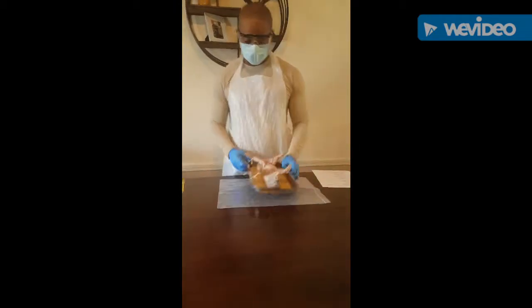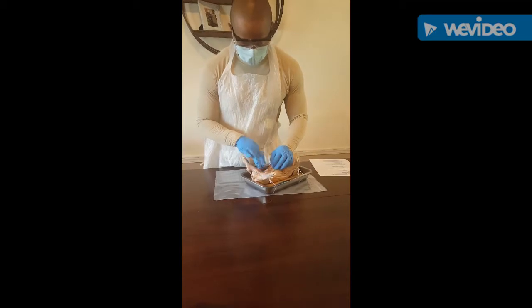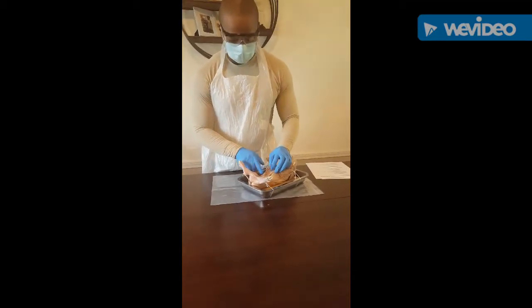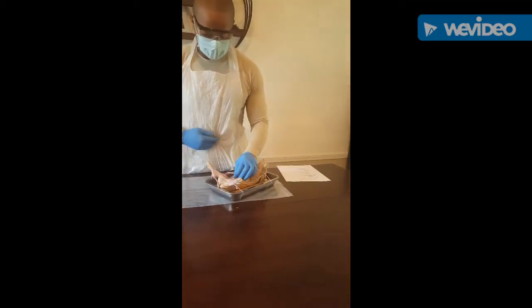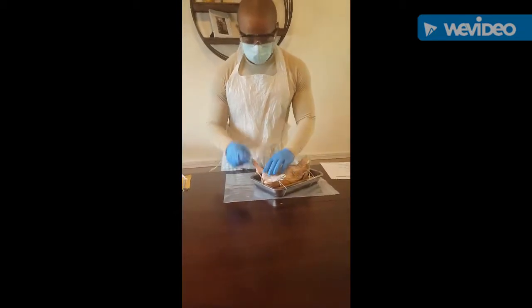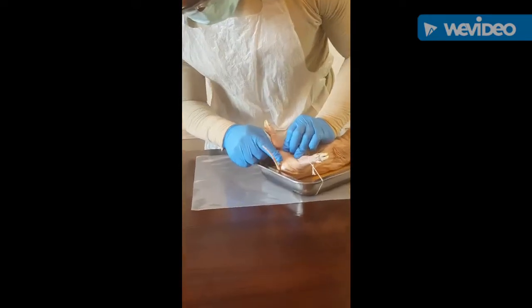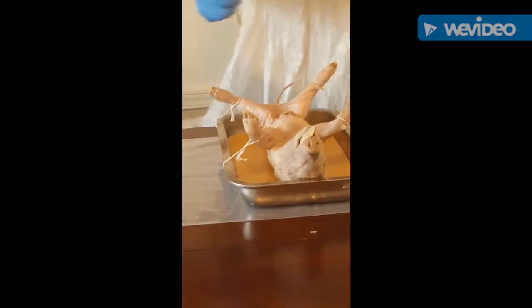And then let's determine the gender of this pig here. So if you can see here, if I look underneath, at the umbilical cord, I see that there's no hole there. But if I come back here, I see there's the anus, and there's also the genitalia hole right here. So this is a female pig.